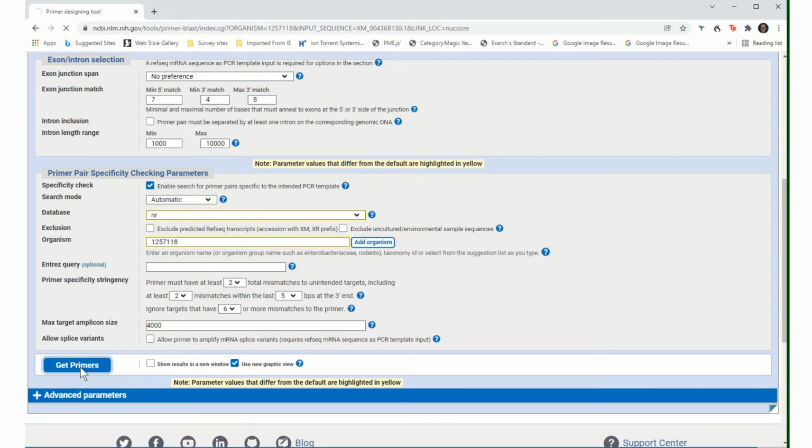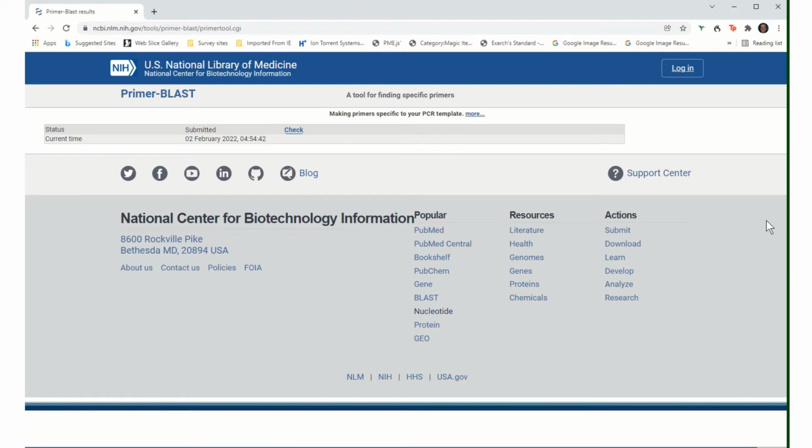And this is then the primer design tool, which is based on Primer3. This is going to compute where the best primers are in that DNA sequence. Now, depending on the time of day and how much else the server needs to do, it can take some time for these primers to come back, and you can keep checking how long it's going to take for your primers to come back.